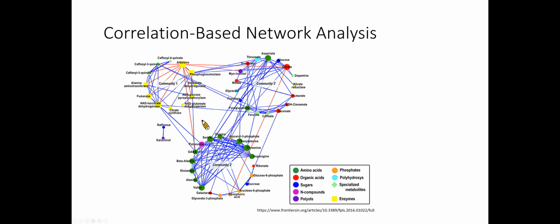Using classical correlation coefficients leads to highly crowded networks where direct and indirect associations are not distinguished. This problem can be successfully overcome using partial correlation. In this approach, the correlation between two metabolites is conditioned against the correlation with the remaining metabolites. Consequently, partial correlation allows us to discriminate between the direct and indirect metabolite correlations.